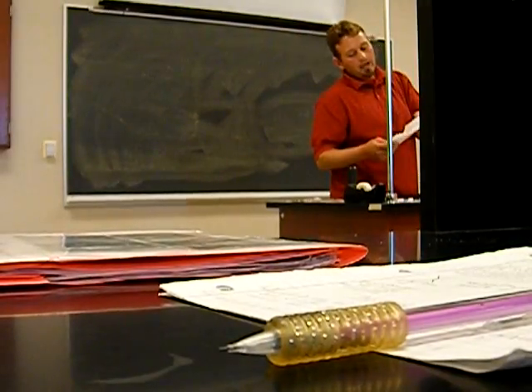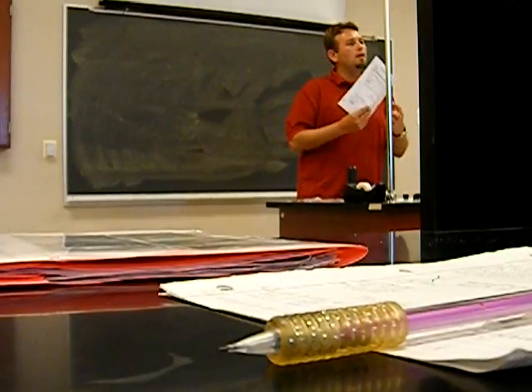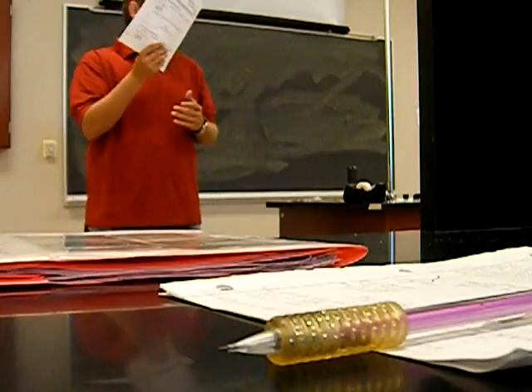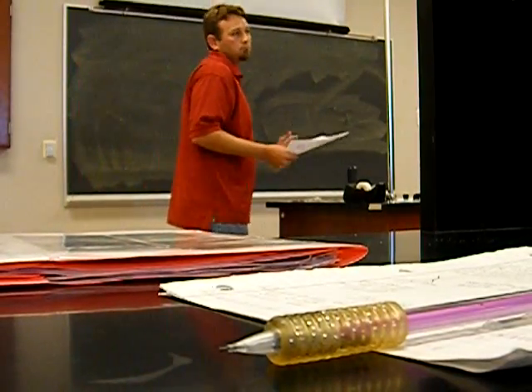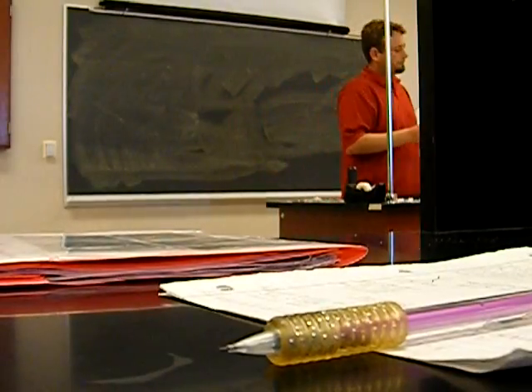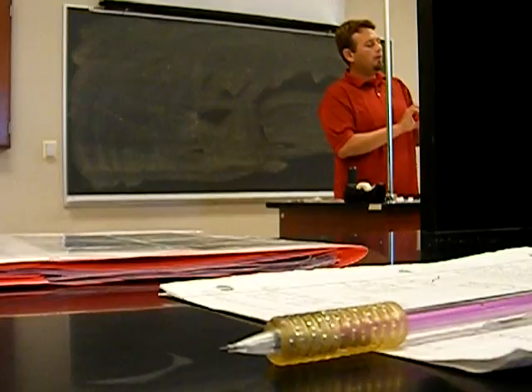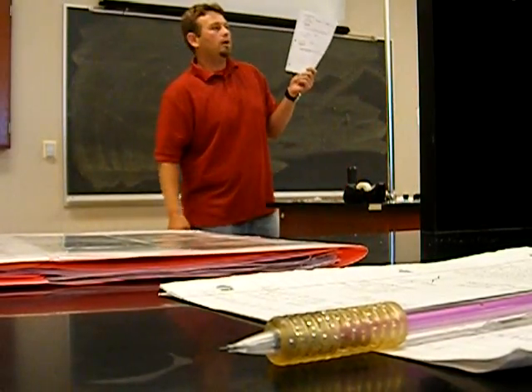Like I said, these reactions, they're not due today. You can just do your observations and your test today, and you can fill in the rest. You have till next week. Okay, this is not due till next week. If you finish it today and you answer all the questions, you can turn it in. That's fine, no problem. Now the only change that we're going to have, if you go to part 4, the iodoform test here, this is the only change that we're going to have. All right.